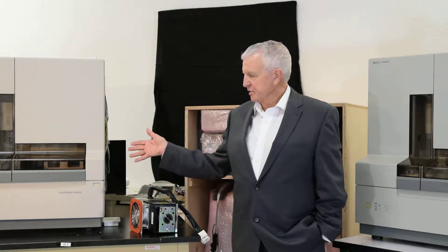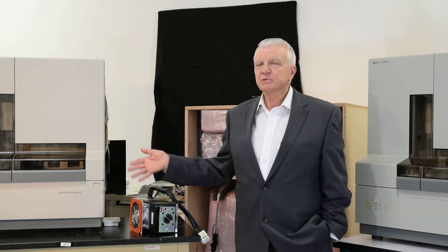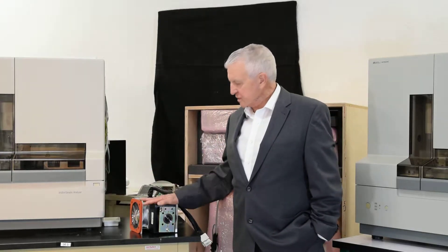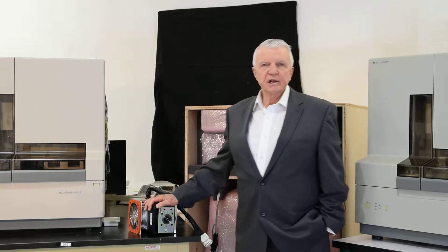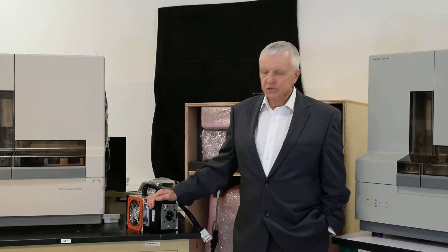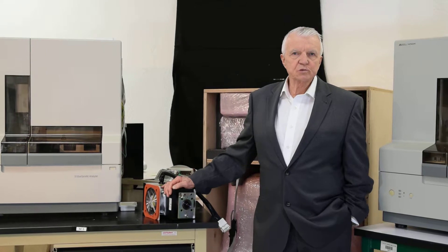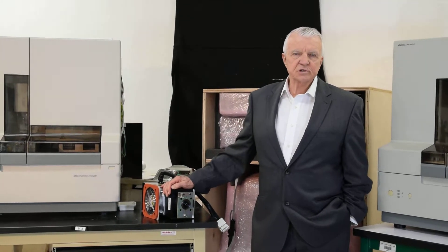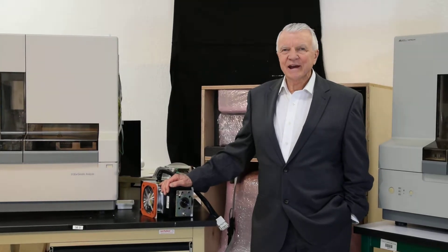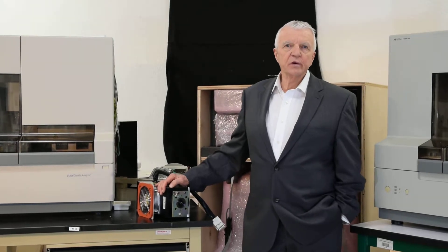These particular Sanger sequencers were originally built by Applied Biosystems, and we've been rebuilding them for about 18 years now. The core of what we do is in the laser. The lasers are going to burn out over a number of years of use. When we started doing the rebuilds, we were using lasers that were recharged, and we found that going with a brand-new laser core — now a laser core that's one inch longer — they just last a lot longer than the OEM ones.